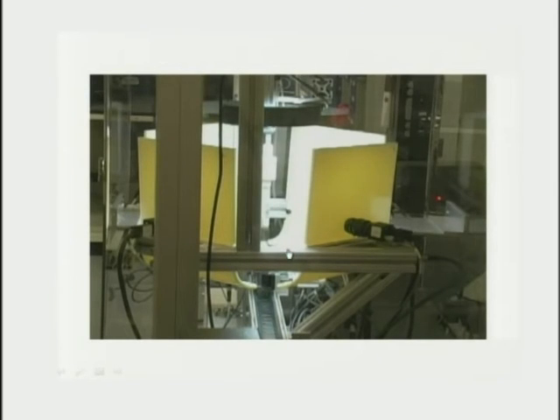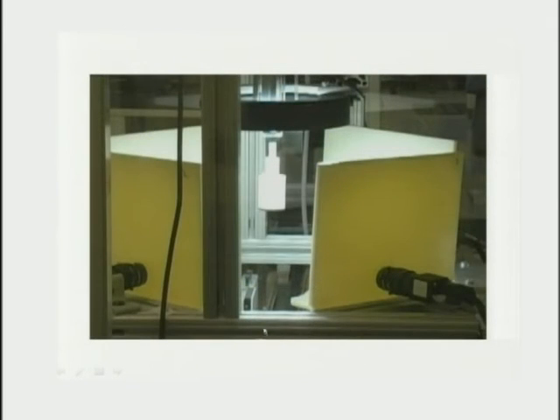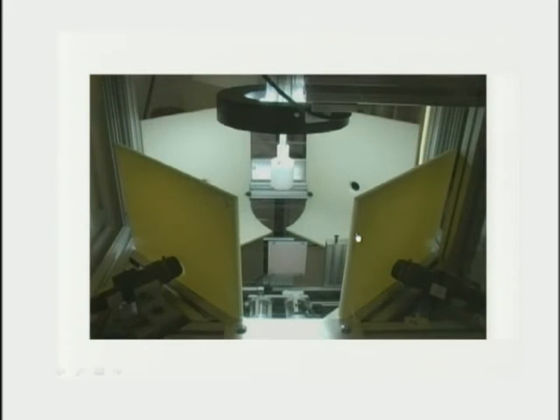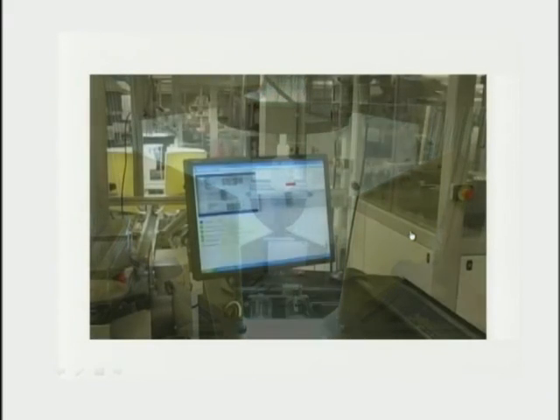So basically, you've taken the outside circumference, the outside of the tube, and you've unwrapped it from a three-dimensional image to a two-dimensional image. So now this view is from the conveyor towards the thing, and now here's a different view. There you can see two of the cameras. You can see a close-up of the robot. We're going to be replacing the robot later this year with something other than a vacuum lifter. It'll be more reliable. Here again now from the side, you can see how there's two of the cameras, and you can see it's picking up a tube.